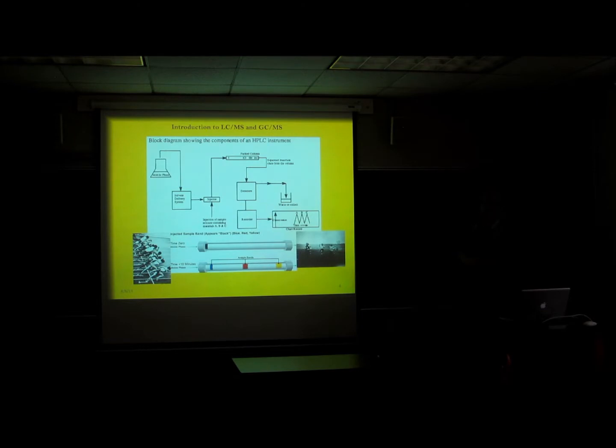Or you can do tandem mass spectrometry, where you use a first mass analyzer as a filter, let that parent mass to charge ratio through, and then fragment it in a second section of the mass spectrometer, break that into fragment ions from the precursor ion, and then use your detector to detect those fragment ions that are specific to the precursor, such that you get a 2-dimensional separation, basically, based on the unique mass to charge ratio of the precursor ion, as well as the unique mass to charge ratio of the daughters.